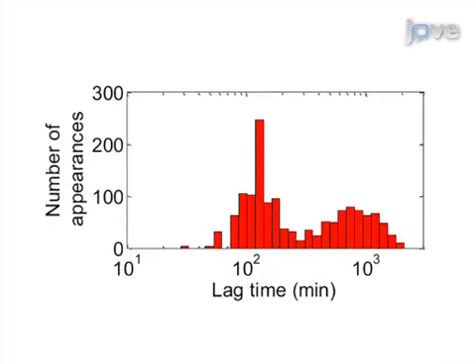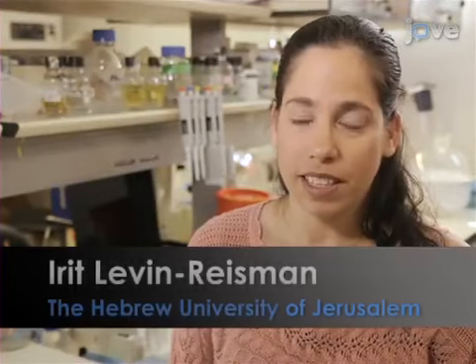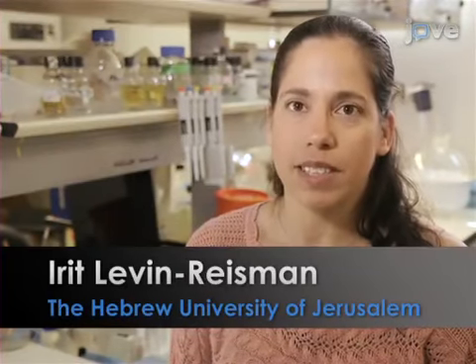Ultimately, MATLAB functions are used to generate the lag histogram using this data. The implications of this technique extend towards diagnosis of persistent infections because it enables detection of slow variants.